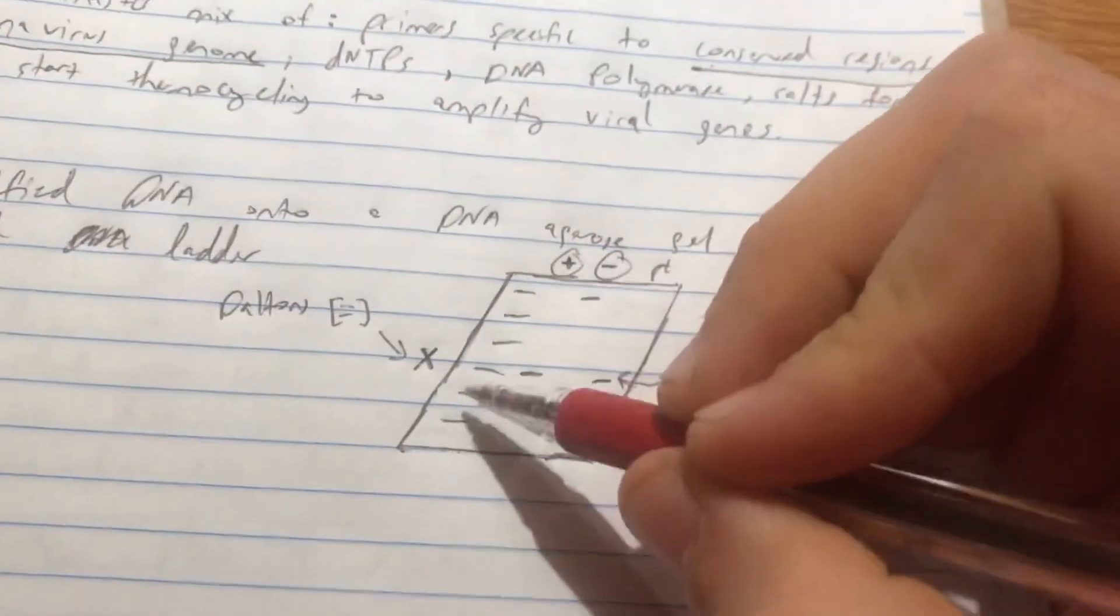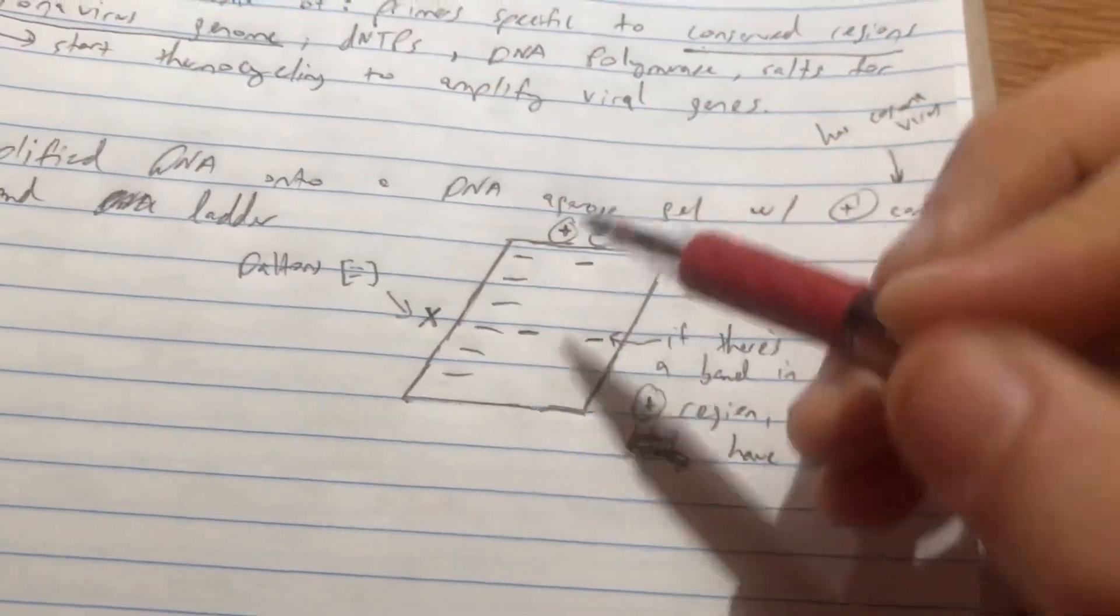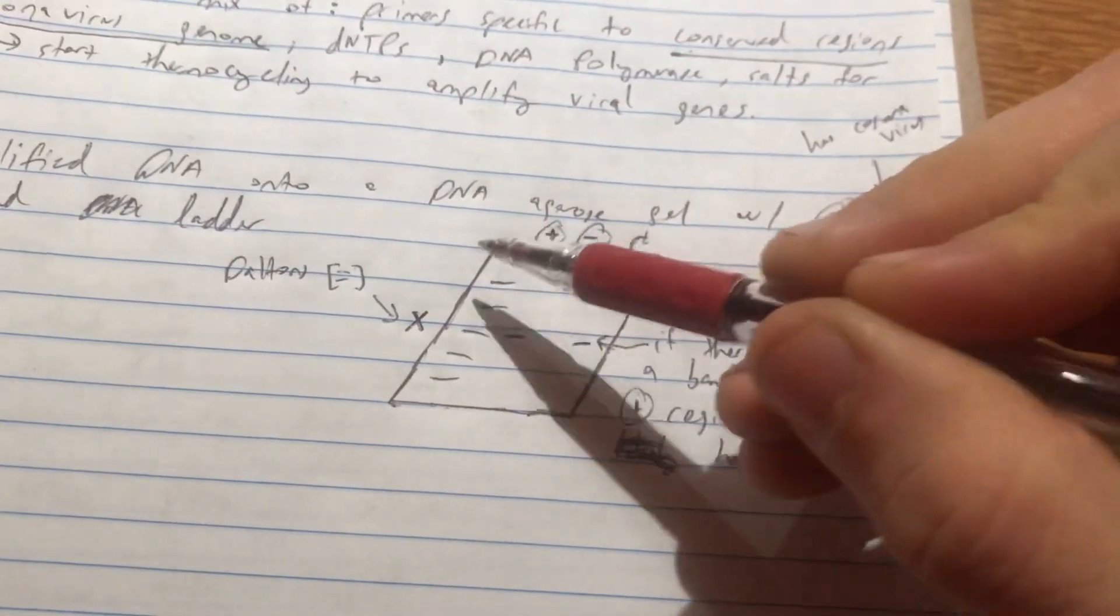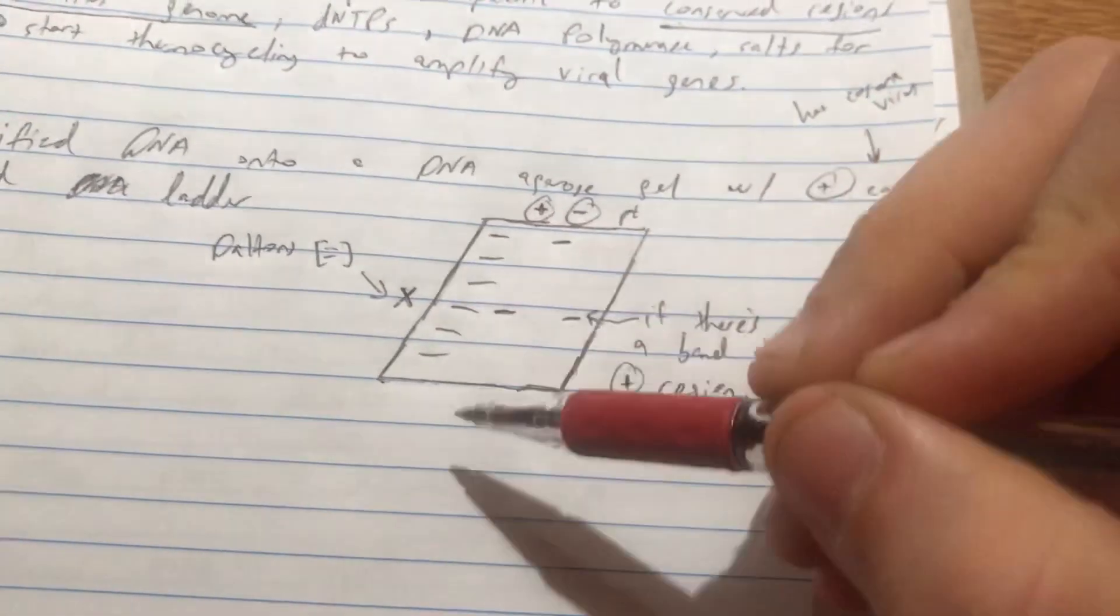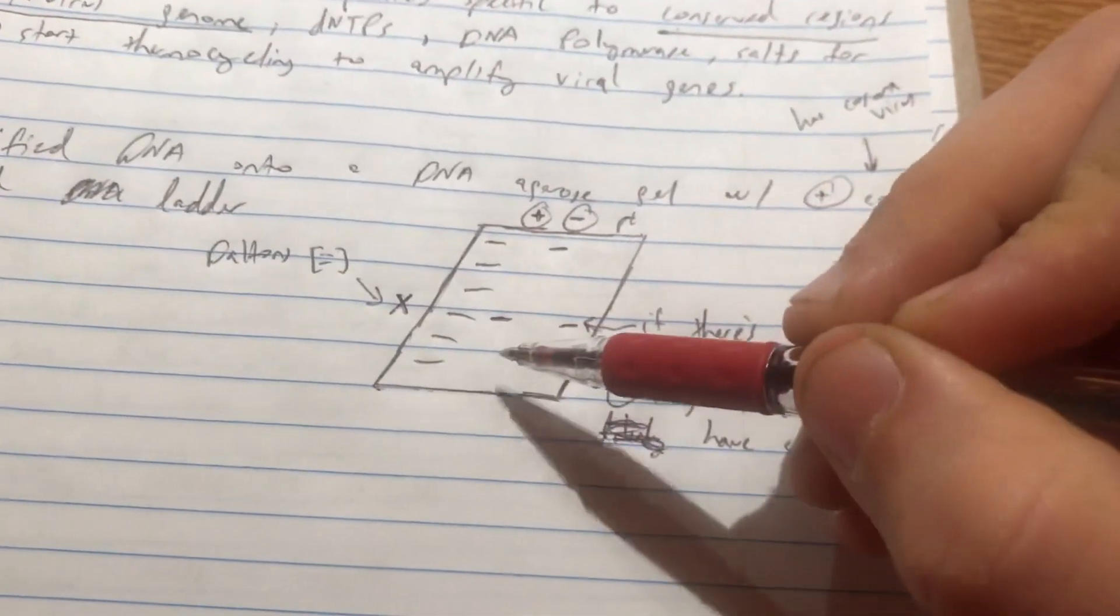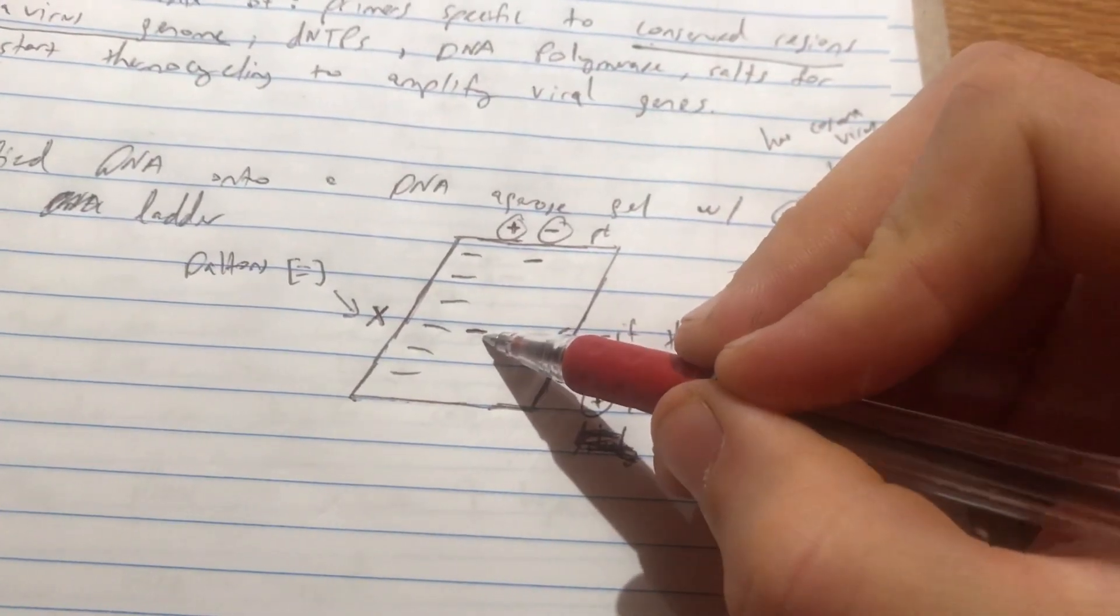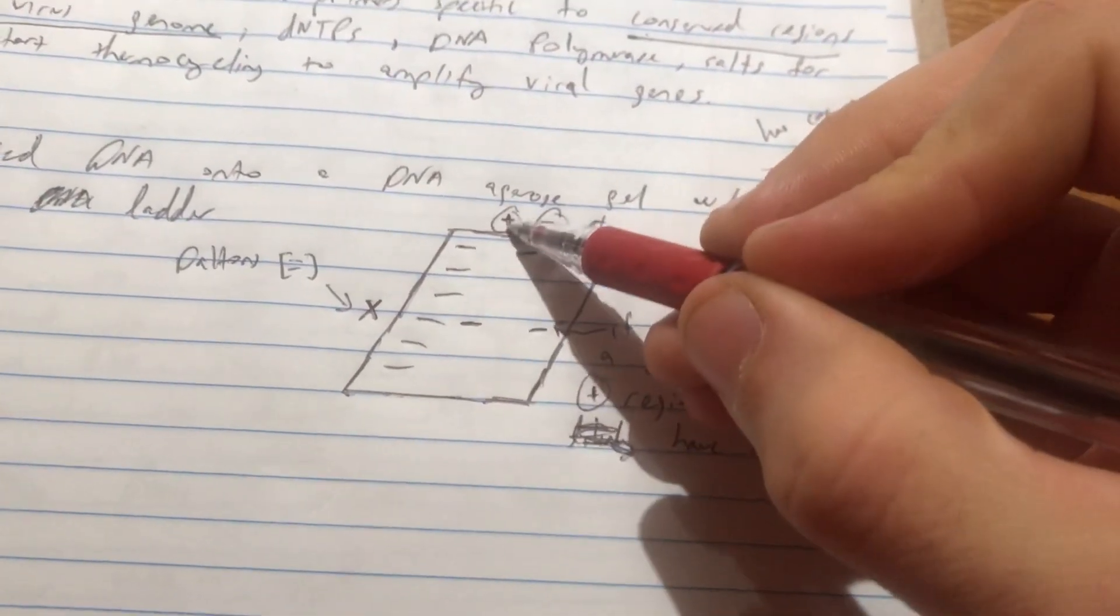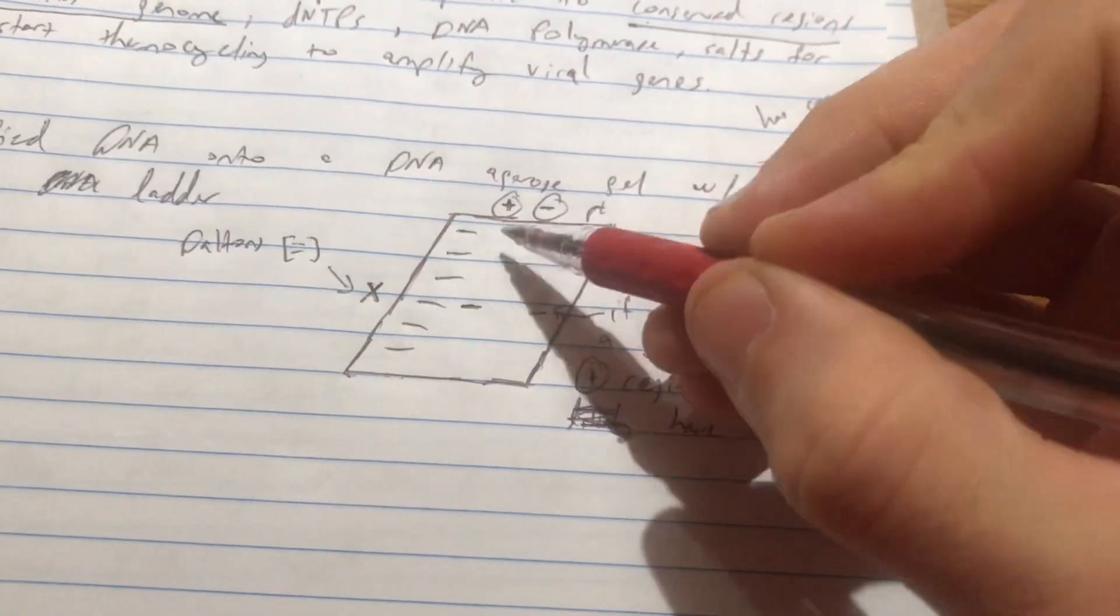And so this ladder here has units of Daltons. They're essentially units of mass. Heavier things are going to take longer to get through this gel because the gel is very viscous. So the lighter stuff's going to be here. We do know that there's a certain size of the coronavirus genome that we are looking for. This makes up our positive control. Our negative control will have another band that we are familiar with.